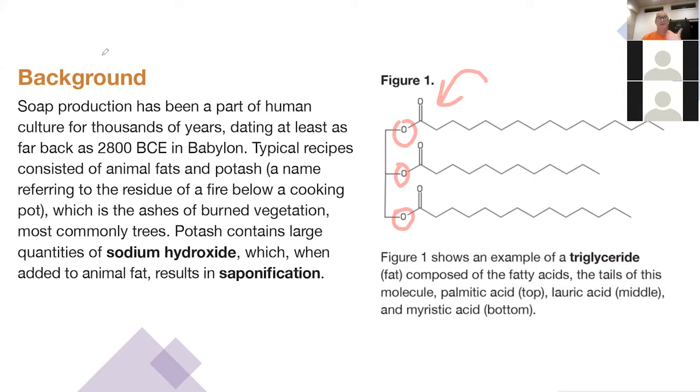And so we know we can break these bonds, either by strong acid or strong base. We'll pop them off, and then when you do, you're left with the carboxylic acid. Actually, if you do it in base, you won't have the hydrogen there.